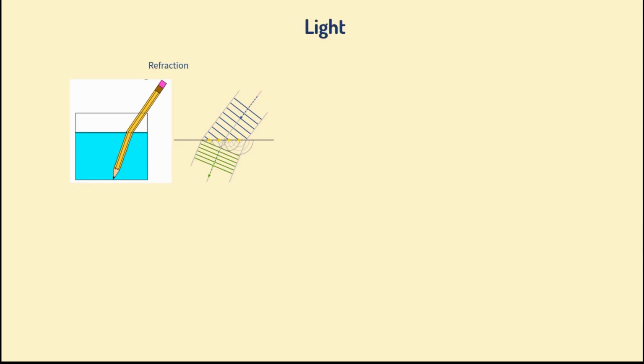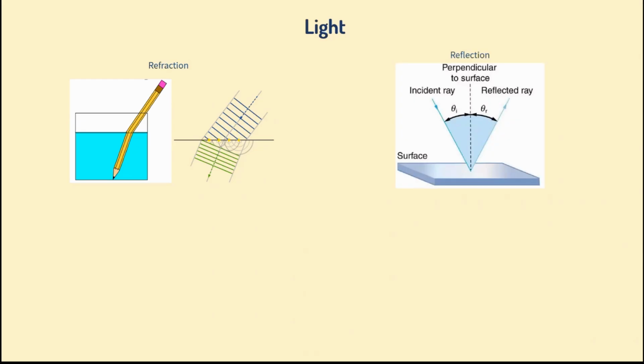So a few key concepts of light that will be useful for later. Light suffers refraction, and this is important because light can be bent when it goes through different materials, like for example the water from your sample, the glass from your cover slip, or the mounting media. Also, the light can be reflected, and this is very useful, not for two-photon, but for some types of confocal microscopy. So when you want to see, for example, myelin or organized structure, you can use the reflection.